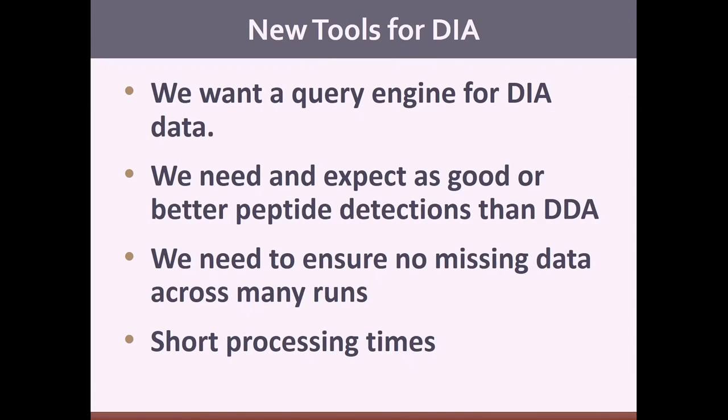So now I'm going to talk a little bit about some of the new software tools that our lab's been working on. These are other things.